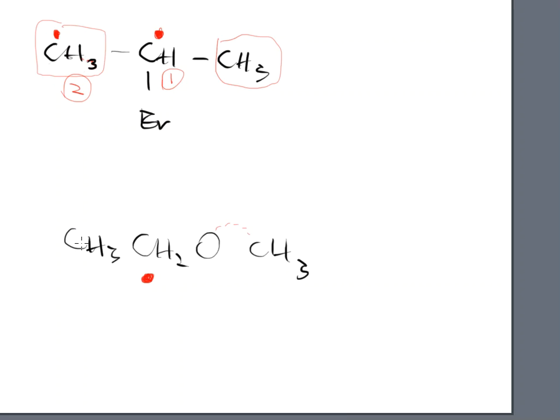And that carbon to the left with those hydrogens, next door to it is a CH2, and then next door to it is an O. So those hydrogens are different. And if we replaced a hydrogen with a bromine, we would get a different name depending on if we chose the left or the right. That's because these hydrogens are in different positions according to that oxygen in that ether group. And I hope that you remembered that was an ether group.